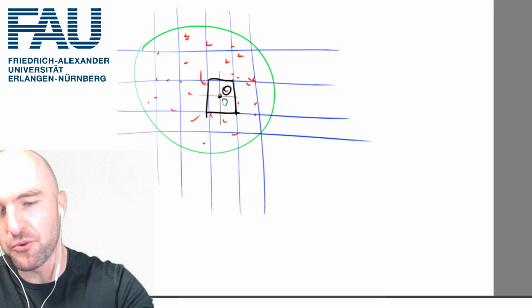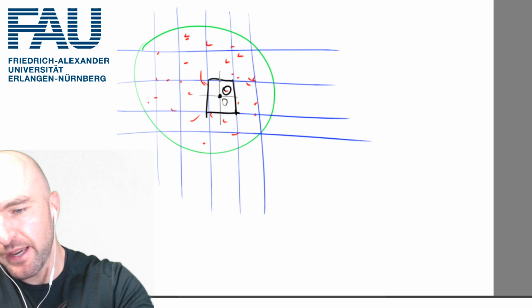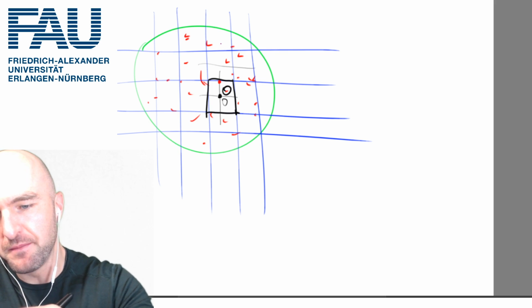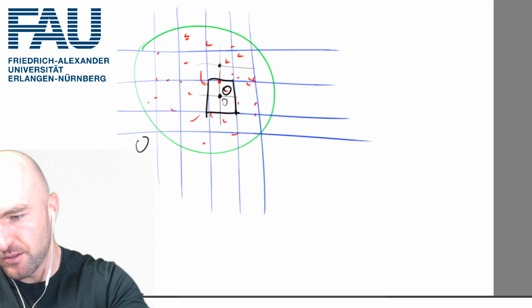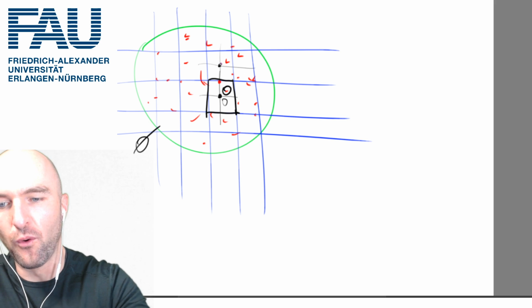Because it's not like right here, and this is pretty close to the center. But if you have a dot that's smack bang here, right close to the edge, then you know you could say it's this thing here. If this is our bin number 1, 2, 3, 4, and this is our origin here, so this would be number 4, 3, and number 4, 4.